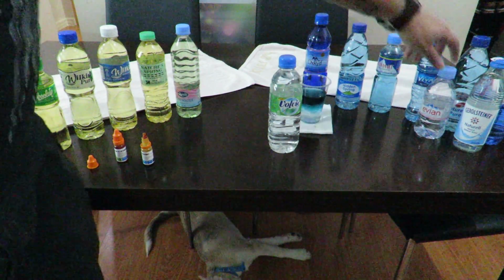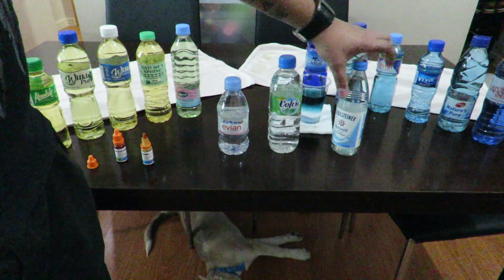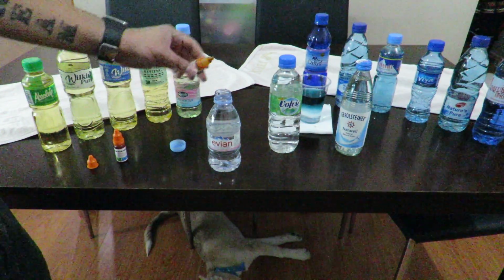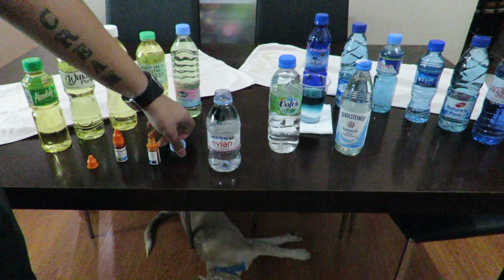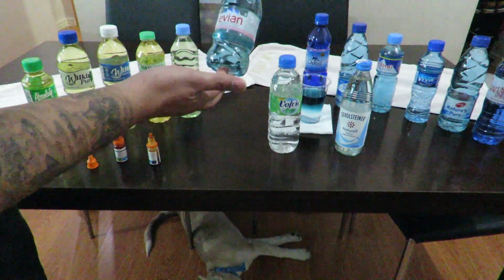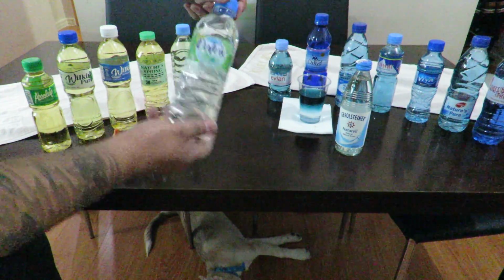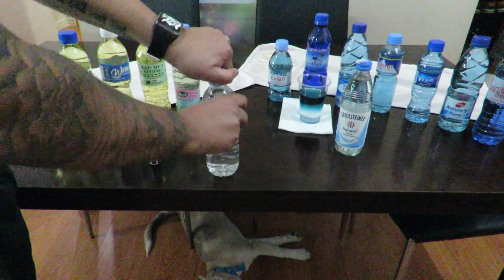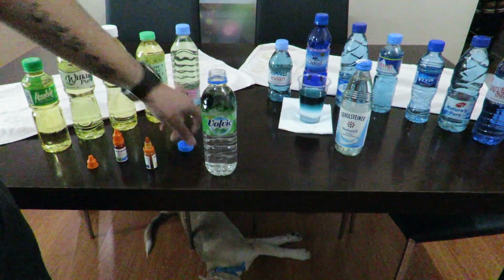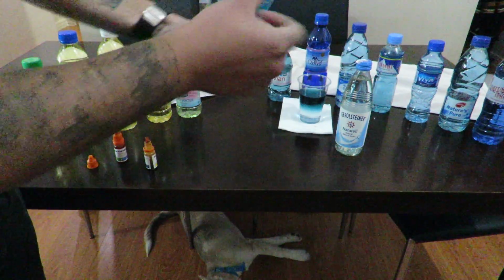Alright, next would be the only ones I saw that seem more imported. These two bottles here are from France, apparently, and this one here is glass, and it's from Germany. So we will test Evian, because everybody knows about Evian. And let's see how well the water is. And Evian says the water is good. That's decent water right there. Alright, now we will try this Volvic, which is called natural mineral water. Shake it, and it turns blue.